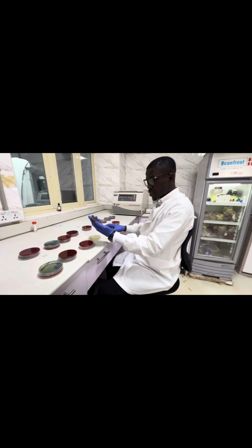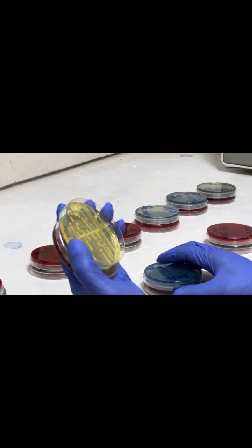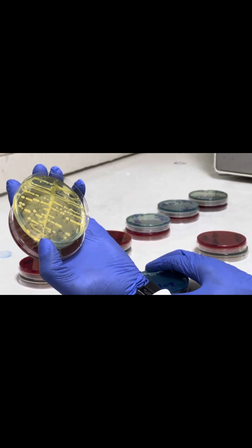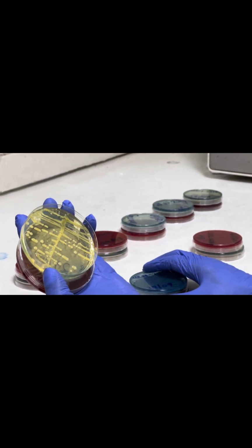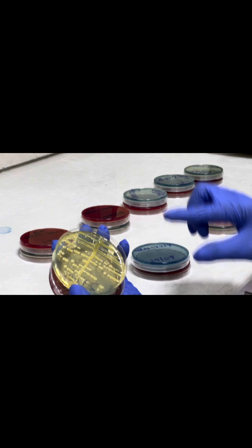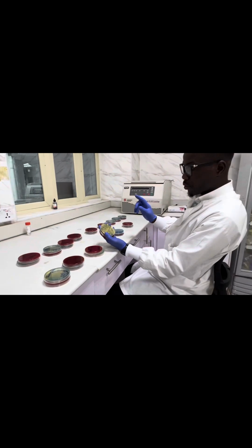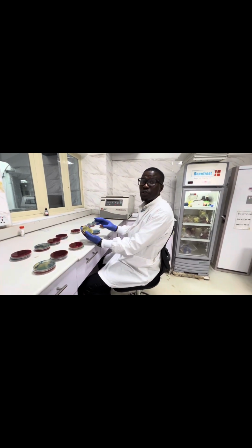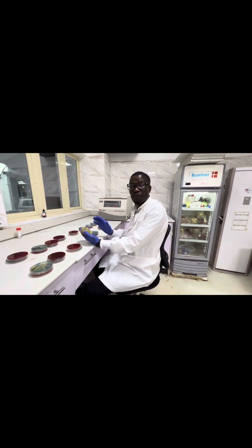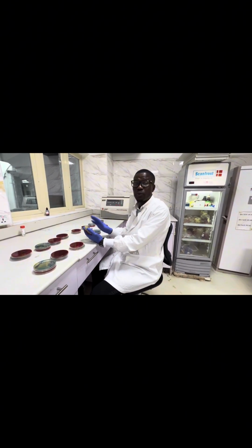This is nice. The growth seems to be uniform. You can see on the CLED, it's very clear. And you can agree with me that this is one single organism growing here. So with this, we can now proceed to do colonial morphology, where we describe what we are seeing.